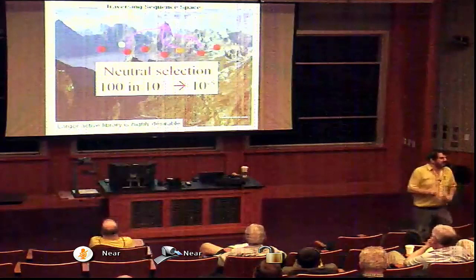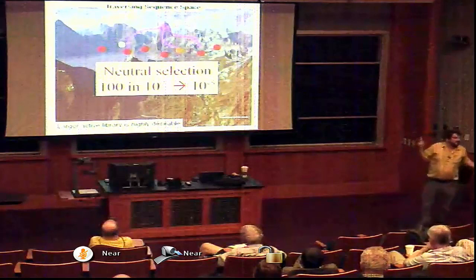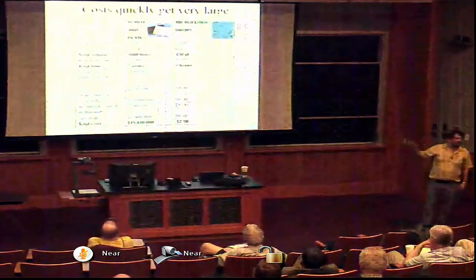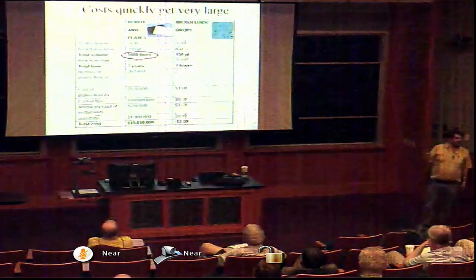If you do 1,000 experiments, you're not going to be able to search a library to find reliably something at 10 to the minus 5. You have to do it this way. You do it once, then the second time you do it really well. Actually, you could do it with a robot. Let me show you why you wouldn't. If you did it with a robot, you'd use about 5,000 liters for the screen. We use about 150 microliters.